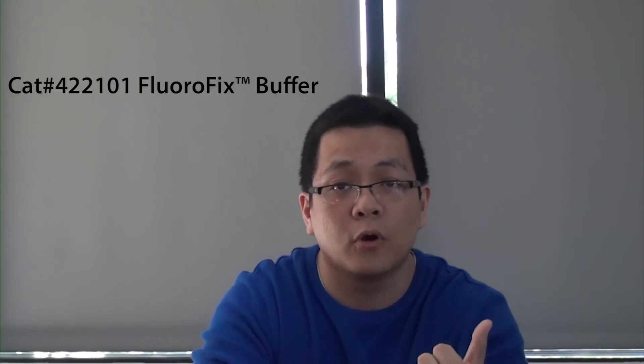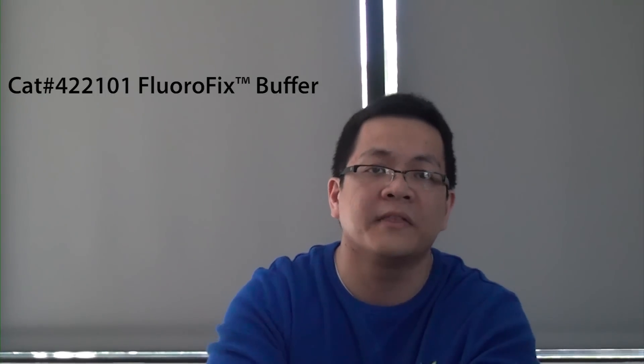Number two: when you're doing fixation with your tandems, you have to keep in mind not to overexpose them to the fixative — they tend to be very sensitive to that. You shouldn't do any more than 20 to 30 minutes. If you want to be on the safe side, you can use our Fluoro-Fix buffer, which is just a gentler method of fixation.